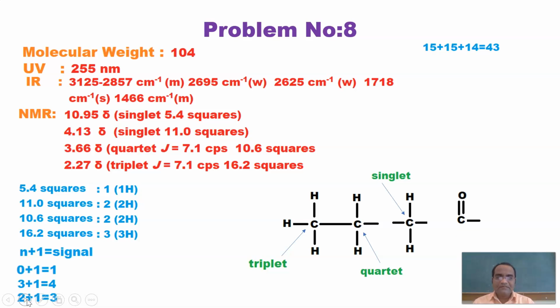After that, it is having some type of carbonyl. That carbonyl is probably an aldehyde, because the IR value shows that in the region of 2700, it is showing a small to weak signal. It means that it is an aldehyde. So the singlet for that NMR value is 10.95. So it is quite deshielded. It means that it might be having an electronegative atom adjacent.